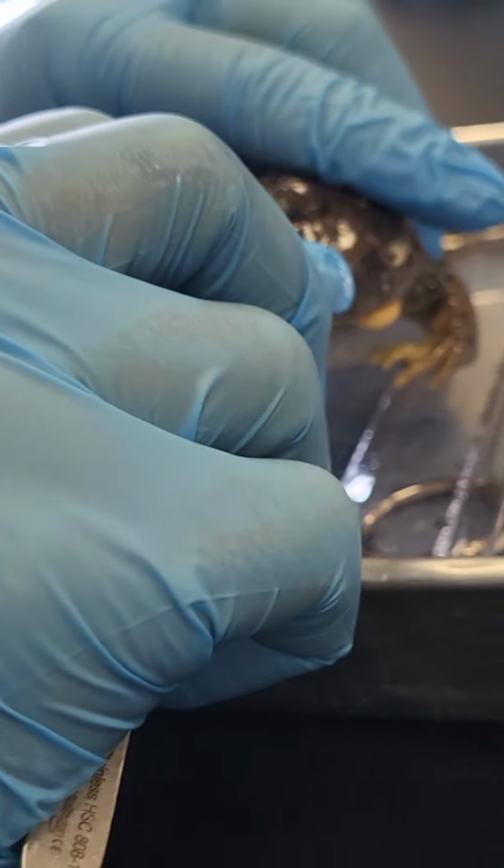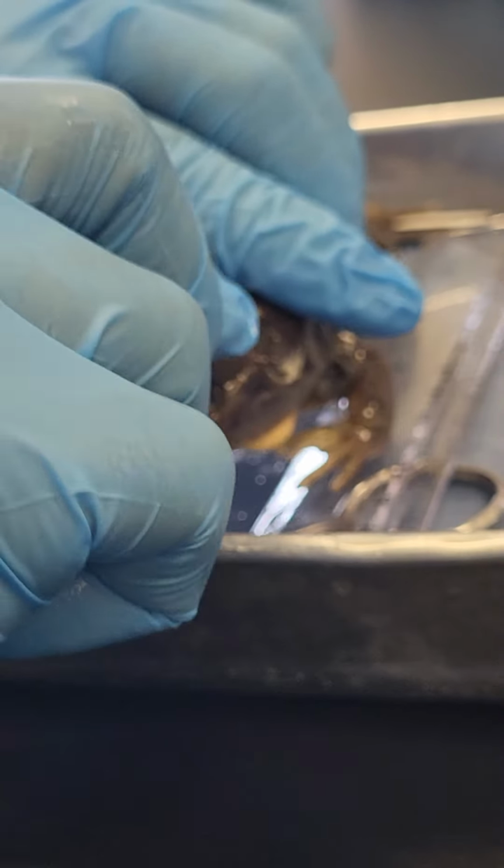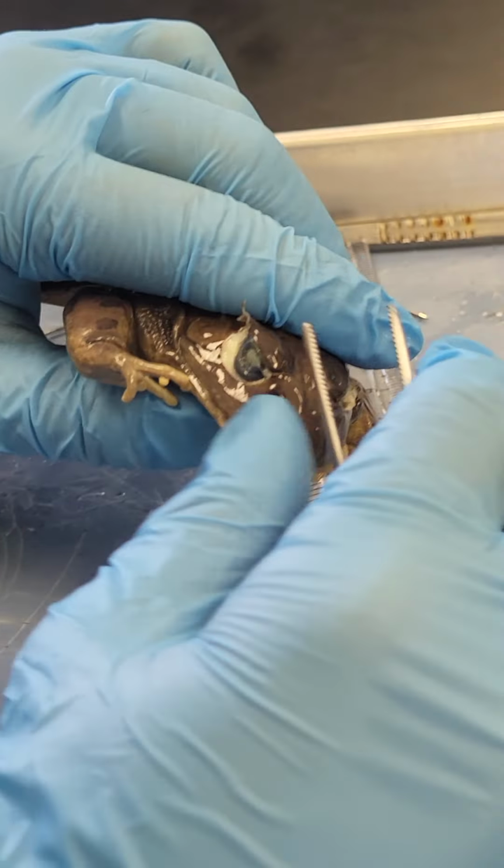What color is the nictitating membrane? It's like black. Oh wait, no, it's white. Yes, white. Off white. And what color is the eyeball? The eyeball's black. Blackish, but maybe blue.